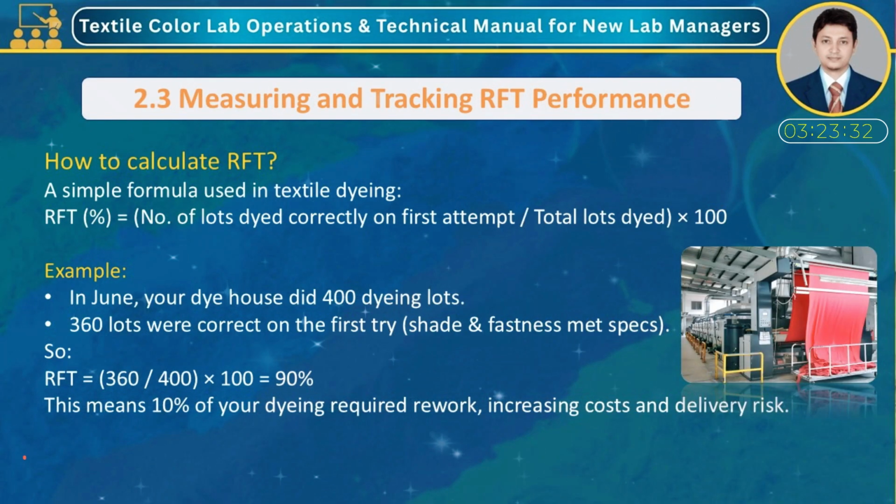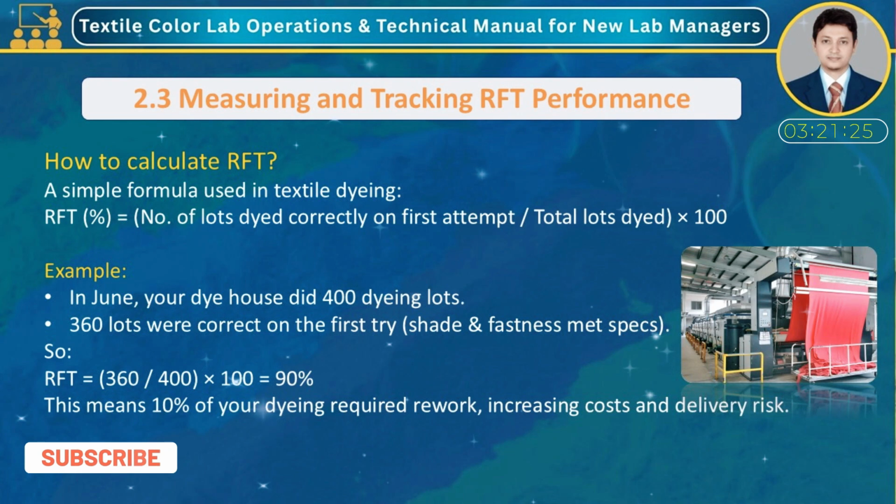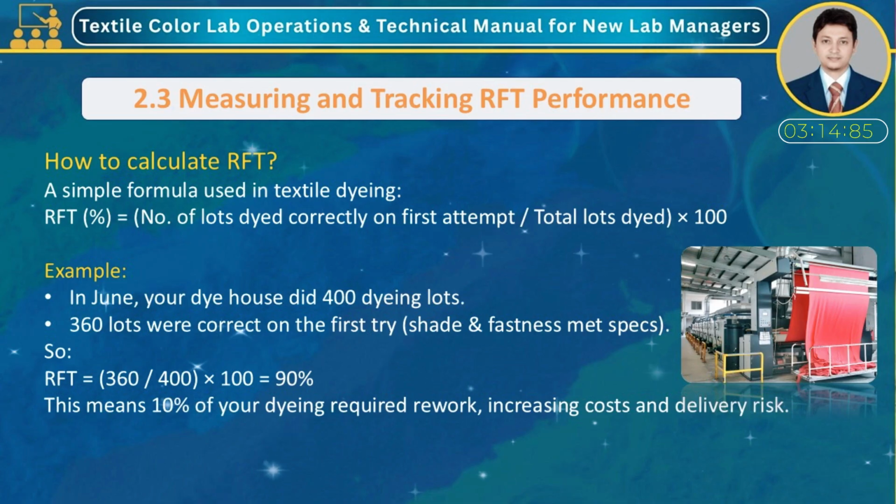Measuring and tracking RFT performance. To improve RFT, we must first measure it. RFT percentage is calculated by dividing the number of lots dyed correctly on the first attempt by the total number of lots dyed. For example, if 360 out of 400 lots pass on the first try, the RFT is 90%. Tracking this number monthly helps identify problems early and control dyeing costs.